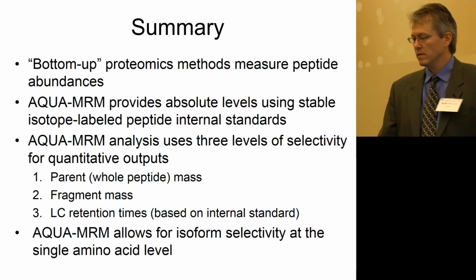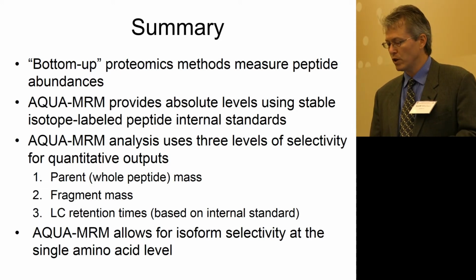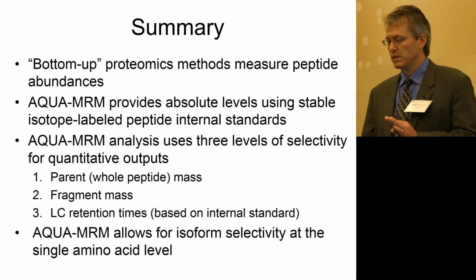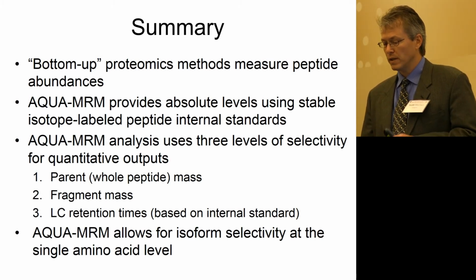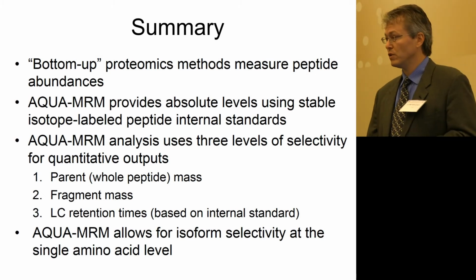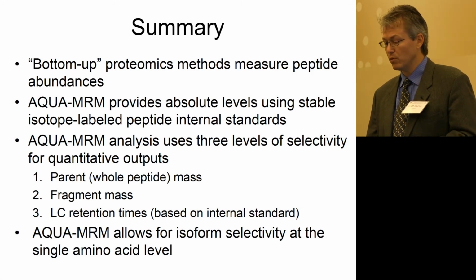And so the summary is, PATC and really this group, PepPro Analytics, is taking their bottom-up proteomics methodology to measure or do selective or targeted proteomics, in this case on allergens. They've got a specific way of doing that with the AQUA-branded multiple reaction monitoring. And so it's important, like I mentioned, there's some distinct advantages. You do have the ability to verify with every sample, every run, exactly what you're measuring, which can be important.